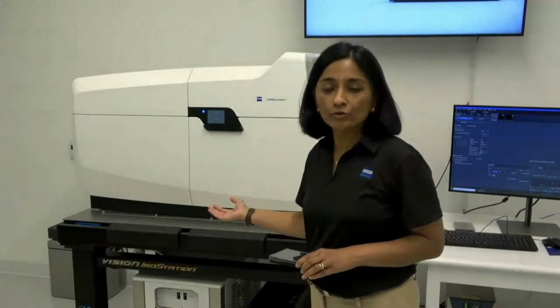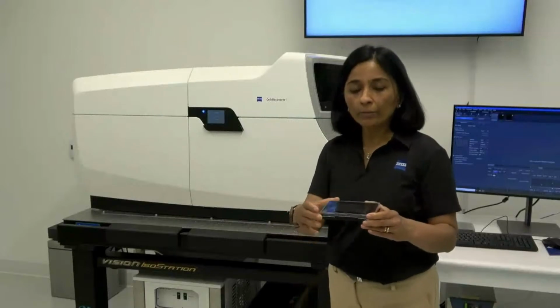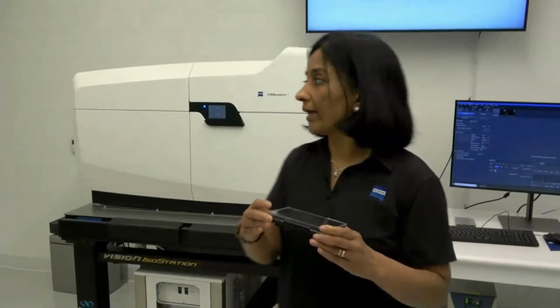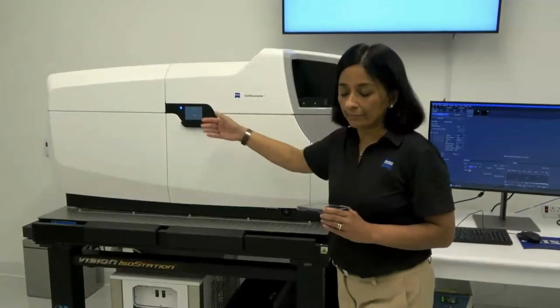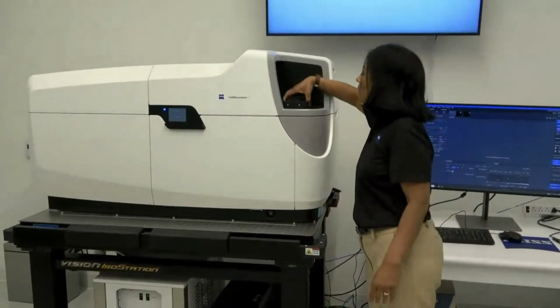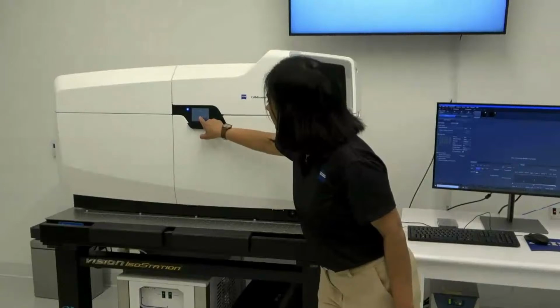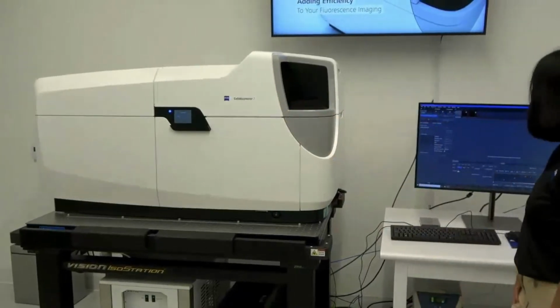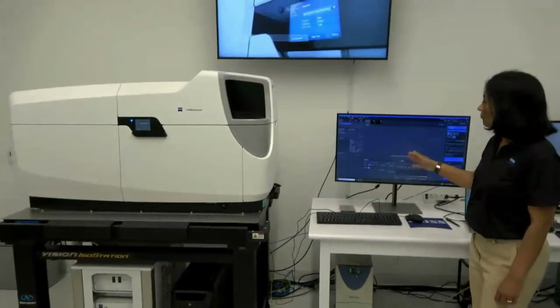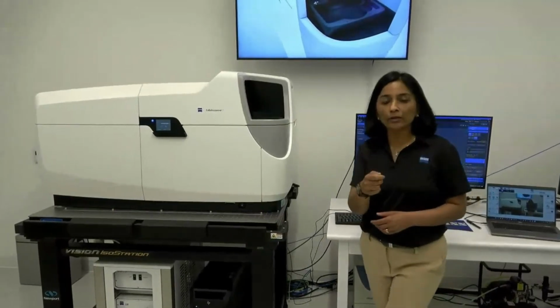Hi, so I'm here by our instrument, the Celldiscoverer 7. And I am also joined by Michael, my colleague, who's helping film this. Thank you, Michael. So the first experiment, we are going to put down a 96 multi-chamber plate into the port here and do a couple of experiments from the TFT, this panel right here. So I'm going to put this plate down into this port right here and load sample from the TFT. What it does is move the plate inside, and then it takes about 1.5 minutes for the instrument to automatically recognize the sample carrier, measure bottom thickness, and tell us what the bottom material was.